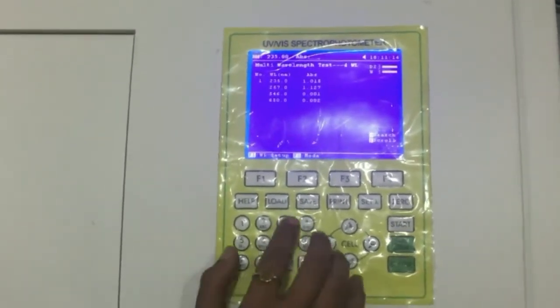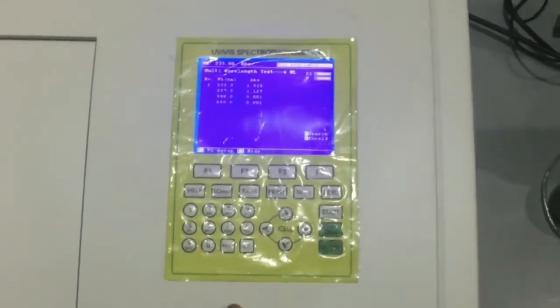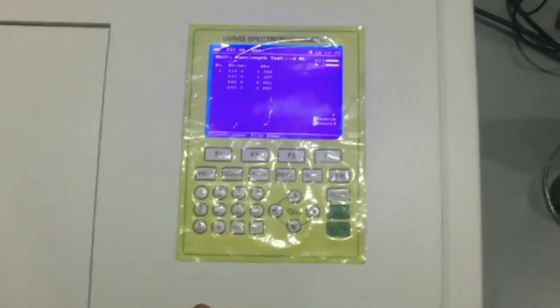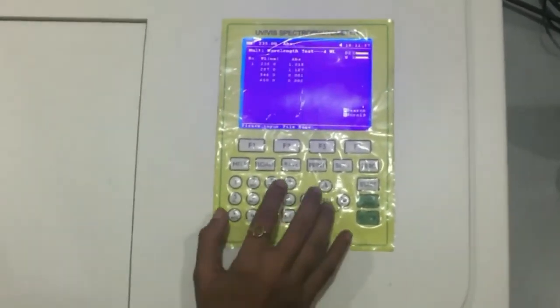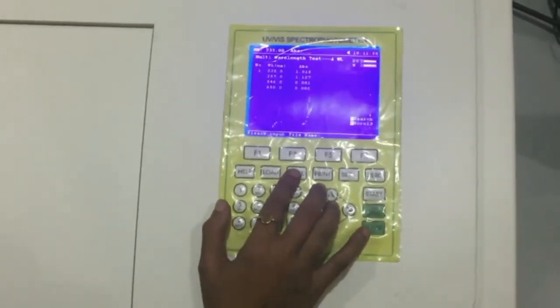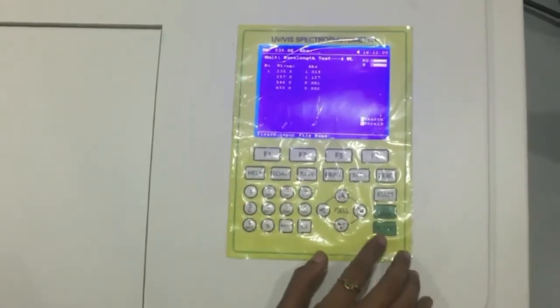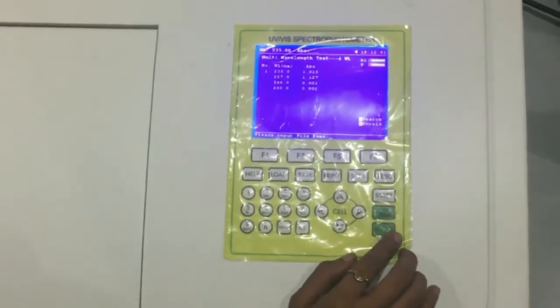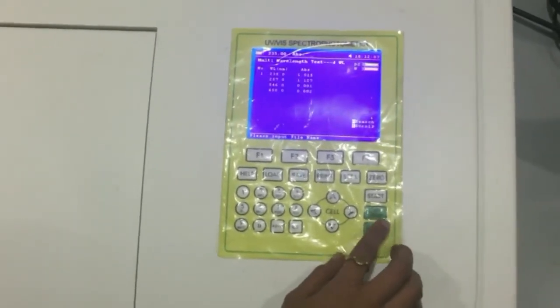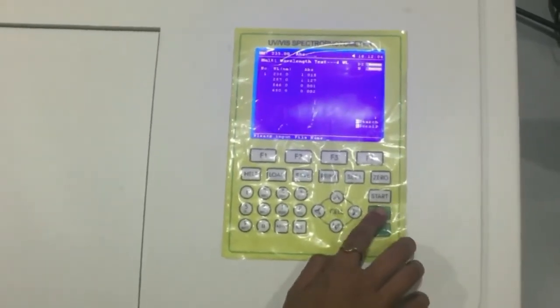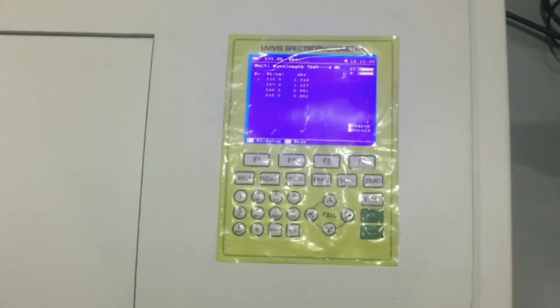You can save your data by pressing save, and then press exit.